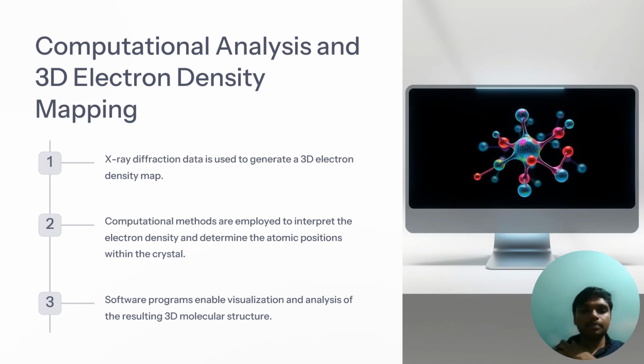By using X-ray crystallography, we can visualize the hydrogen bonds between the amide groups and how this interaction contributes to the overall stability of the crystalline structures. This understanding is essential for designing polyamide materials with enhanced properties such as improved strength, heat resistance, or moisture retention.